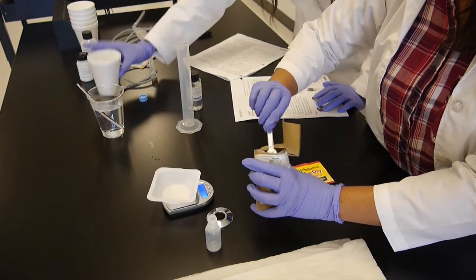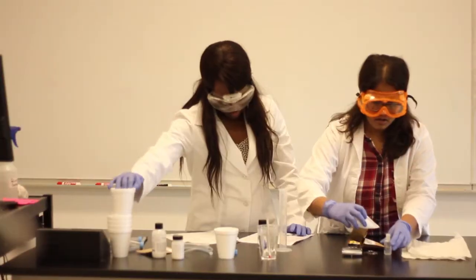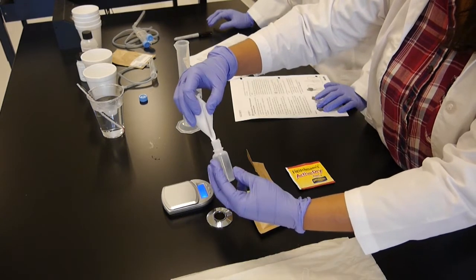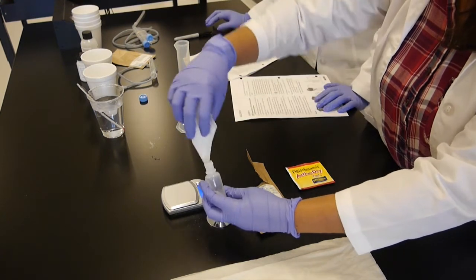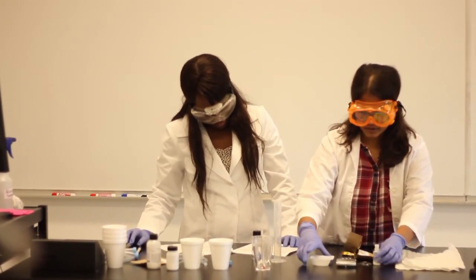There you go. About 1 gram of sucrose. Let's take the pan and let me put it. I have already labeled it as sucrose, SUC. And let me put this right here. Now, I spilled a little bit.